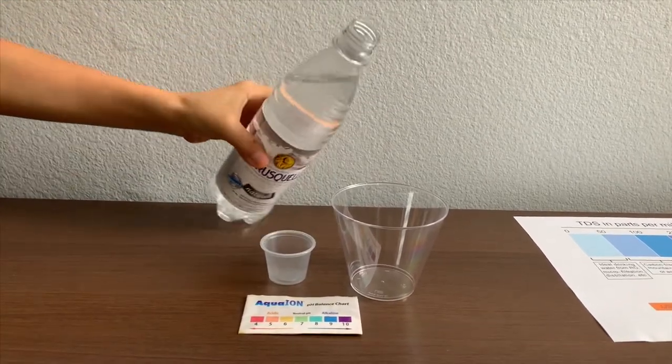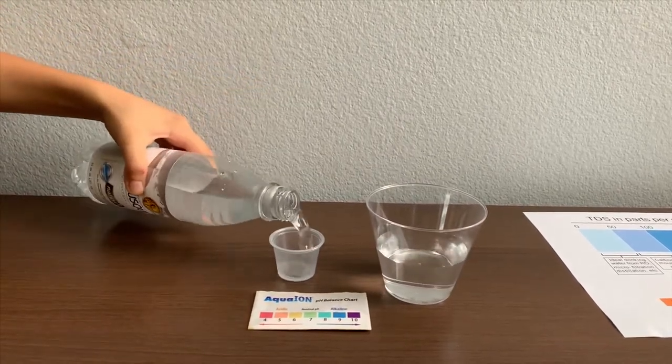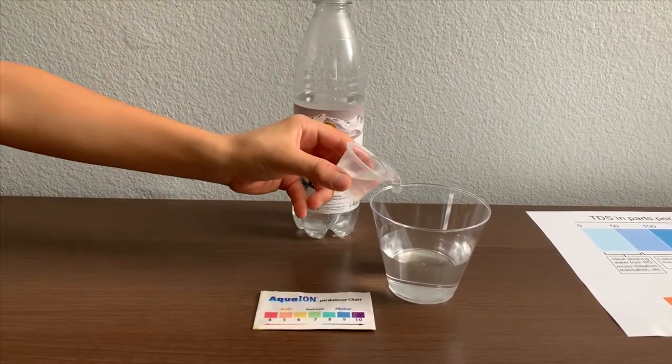Let's pour some water in. This is a little too much for the pH, so let's pour some back for the TDS test.